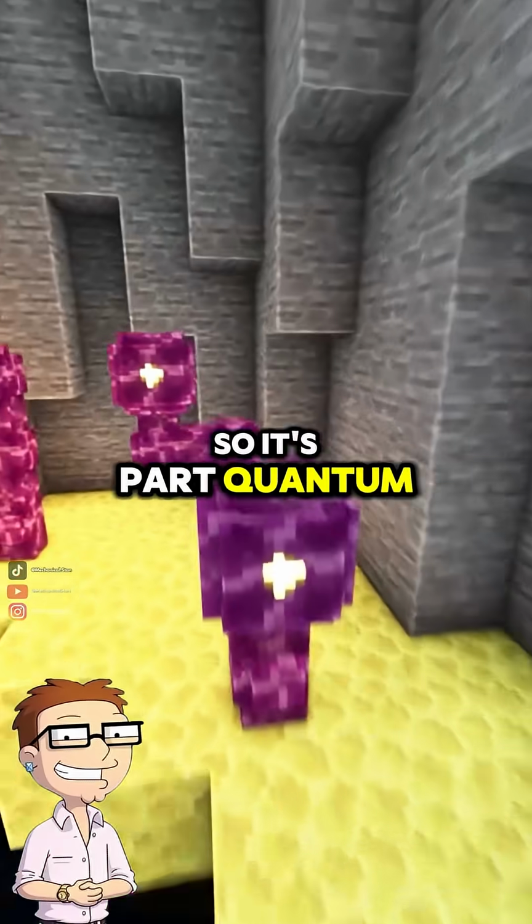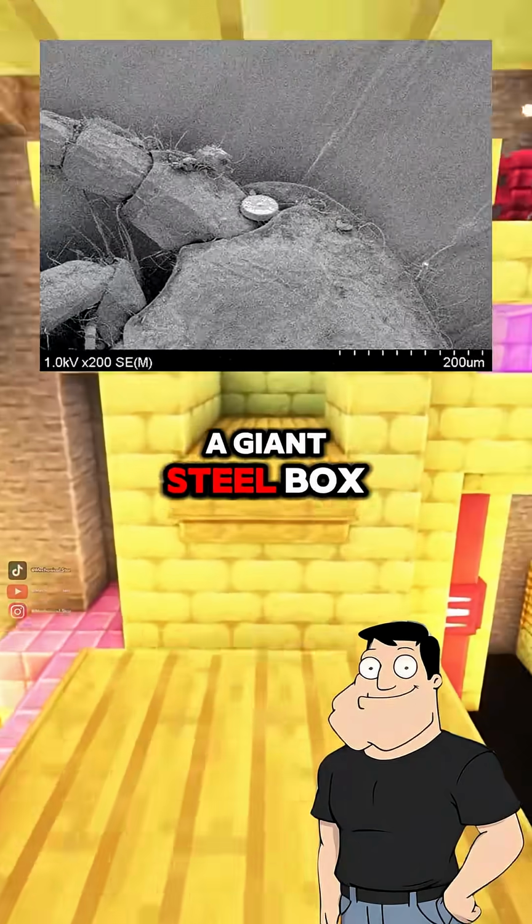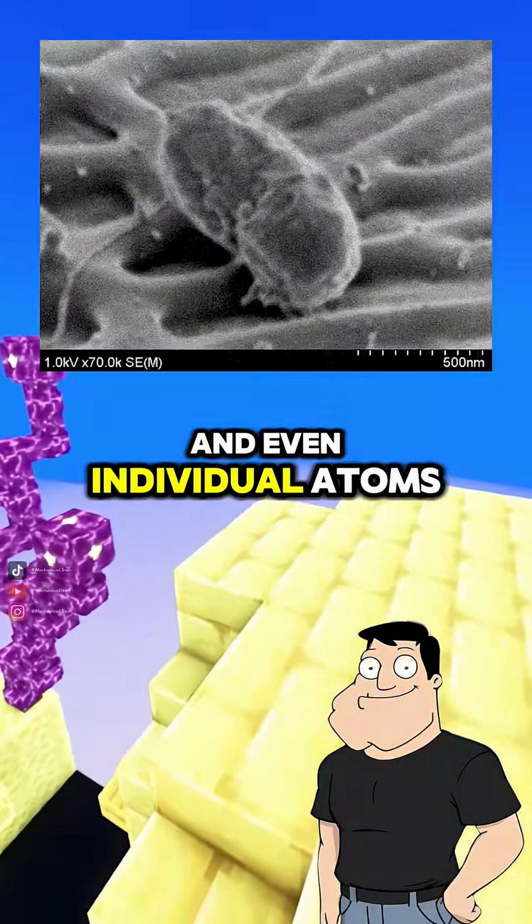So it's part quantum, part electromagnetism? That's right. It's quantum mechanics in a giant steel box. And it's how we image viruses, nanomaterials, and even individual atoms.